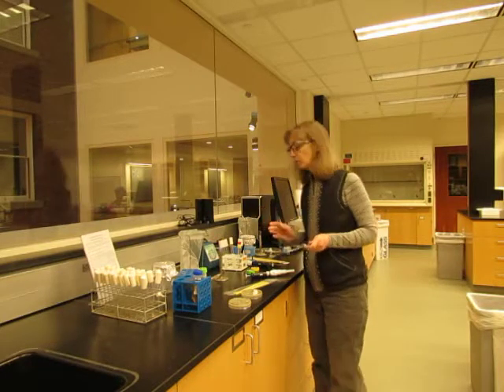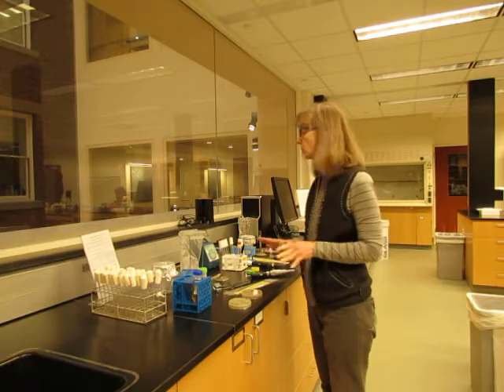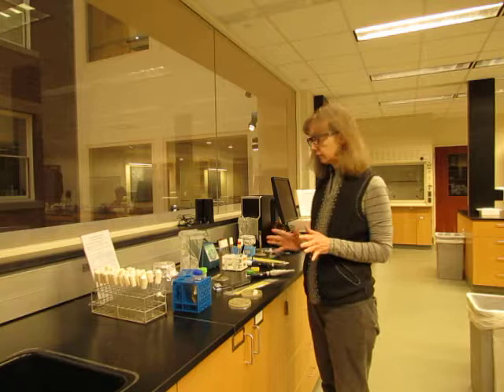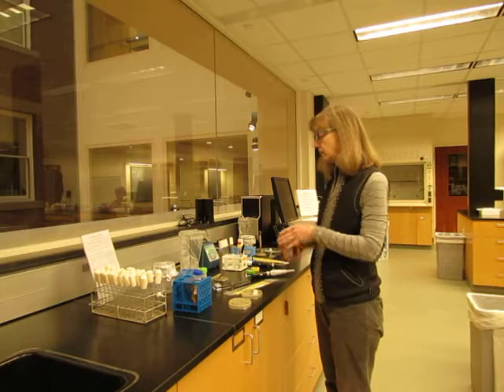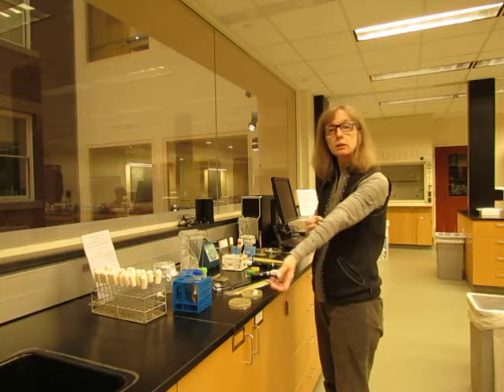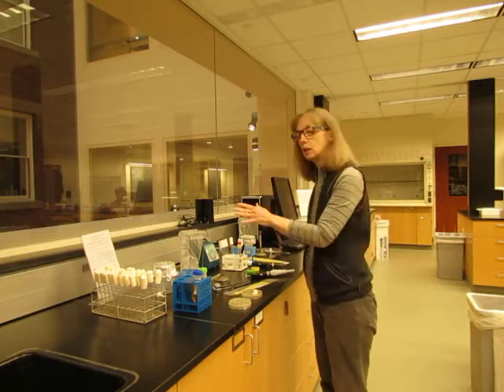A couple of safety precautions with this procedure: never wear gloves while you're doing this because gloves are highly flammable. In addition, you want to roll up any long sleeves, tie back your hair if it's really long, and don't lean over the flame.